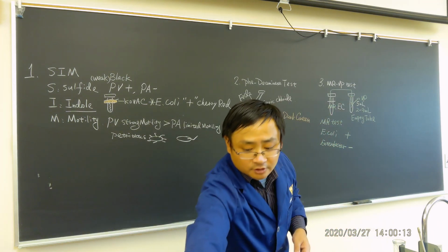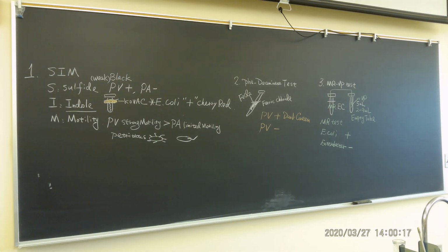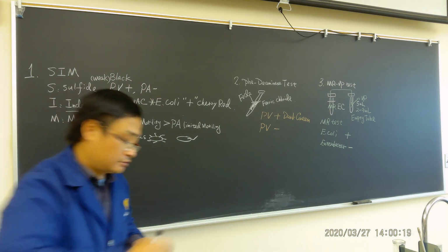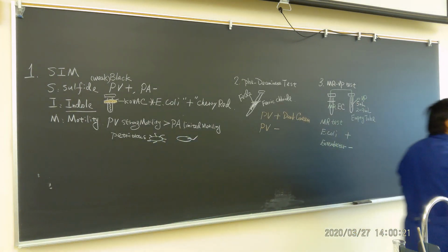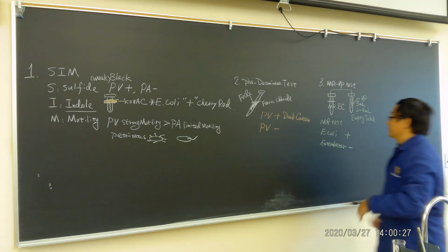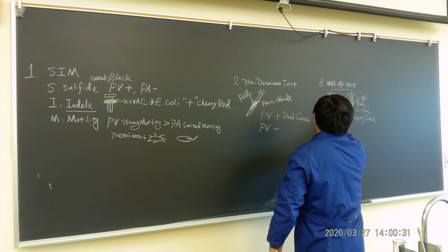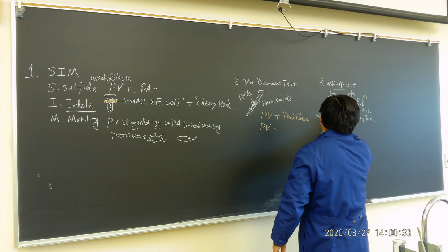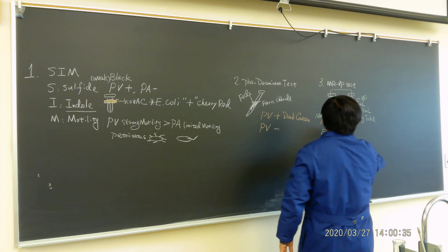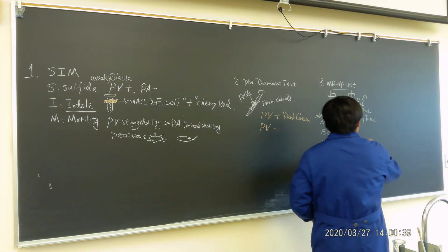Okay, so I'm going to return these two to them. And you return this one back to me, and I'll return this to them. Okay, so this is the MR test, MRVP test part. Just write it in MRVP. Okay. We're going to do VP test.